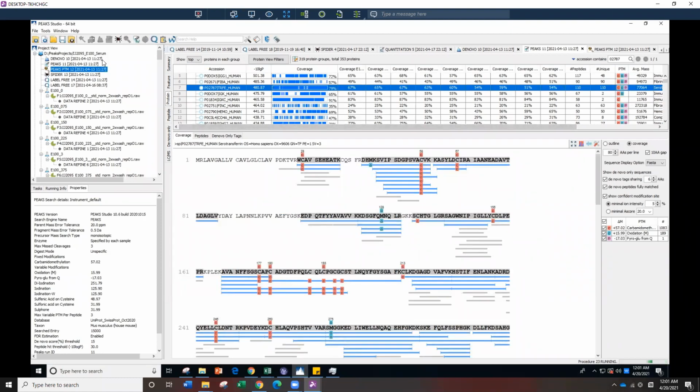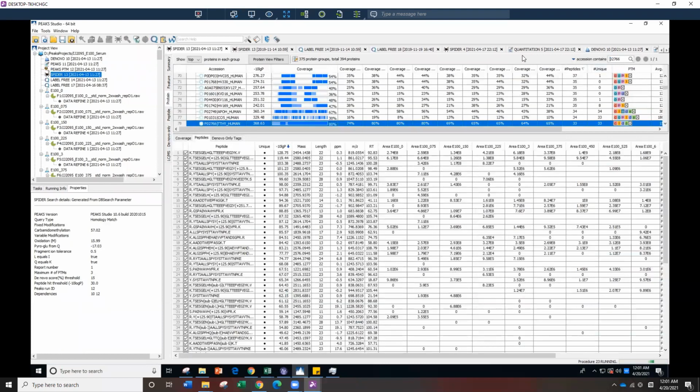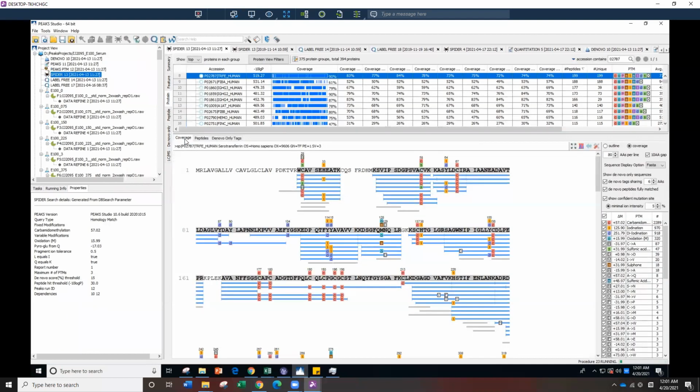And the next step is SPIDER. I think I have this one pulled out already because I looked at it already. And transferrin is the other one I'm looking at. So, as I just mentioned, with each step we increase the peptide numbers. For SPIDER, we look at point mutations, and now we have 199 peptides. So what are the differences between these steps?